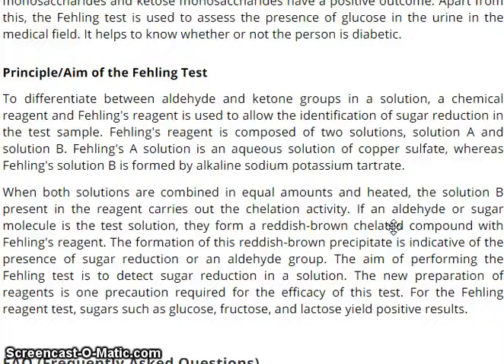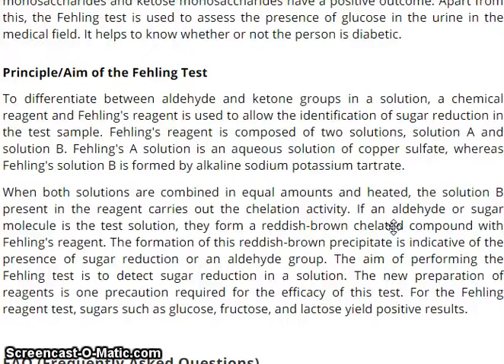The aim of performing the Failing Test is to detect sugar reductions in a solution. Fresh preparation of reagents is one precaution required for the efficacy of this test. For the Failing reagent test, sugars such as glucose, fructose, and lactose give positive results.